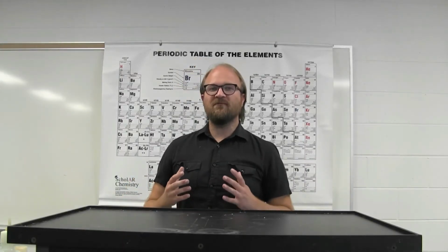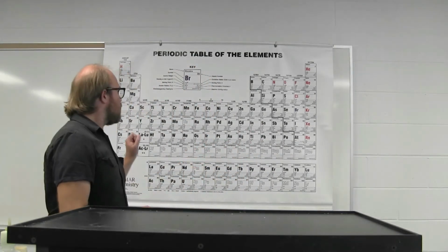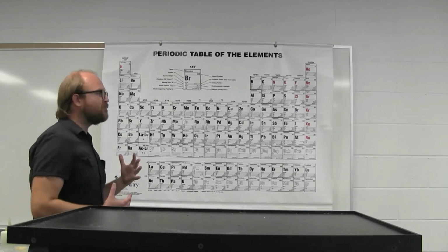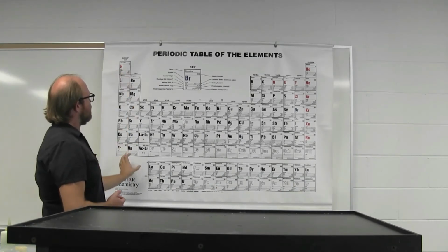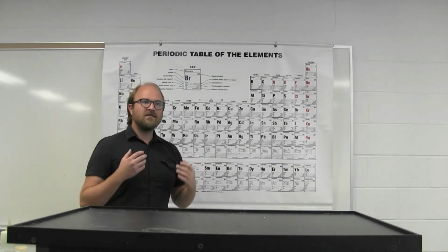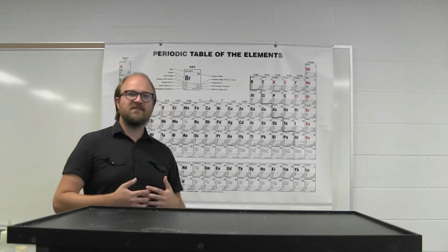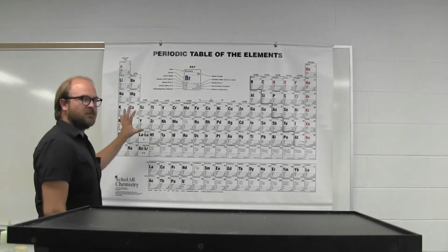Overall, this experiment focuses on the trend of solubility as it relates to position on the periodic table. The periodic table is arranged in such a way that elements with similar properties are grouped in the same column and the same row or period. As you go through this experiment, you're looking at the number of times an ion reacts and where it is on the periodic table.